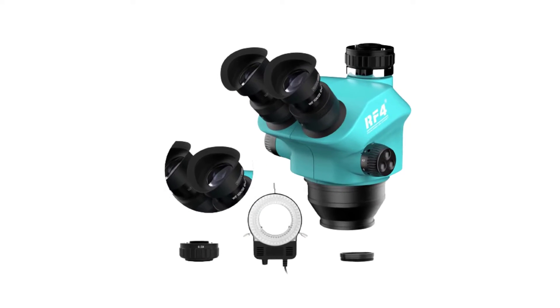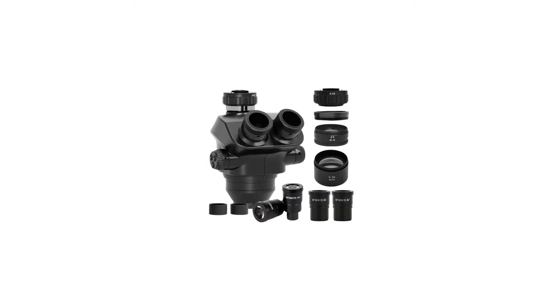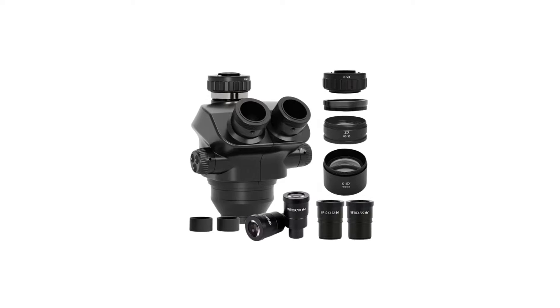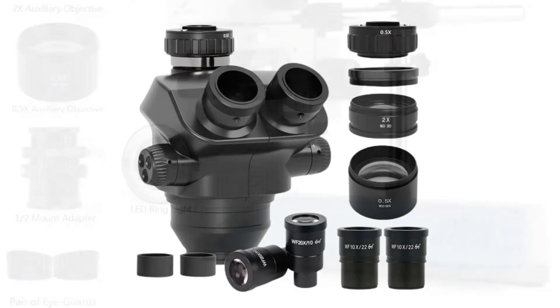Whether you're a scientist, researcher, educator, or enthusiast, this guide will assist you in finding the perfect trinocular stereo microscope to meet your specific needs, ensuring that you don't miss a single detail in your microscopic exploration.